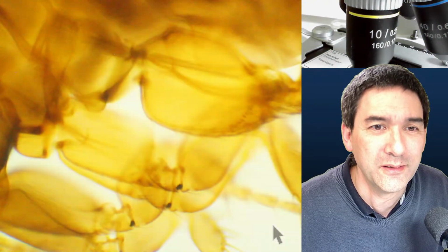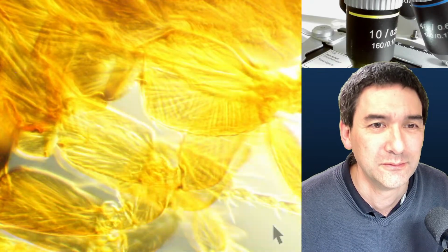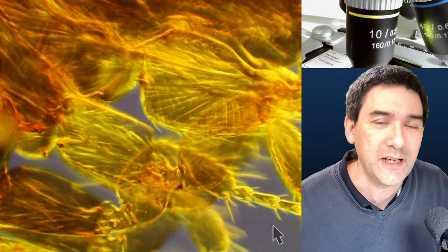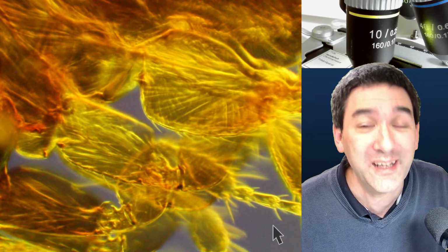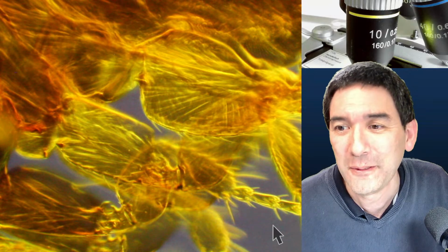And if I open it up again, we're by far not able to see them quite as well. And again with the filter, we're able to see them much better. So that's one of the nice demonstrations to show that these filters are not only useful to add a little bit of color for aesthetic purposes, but that we're actually able to see structures that otherwise we were not able to see.